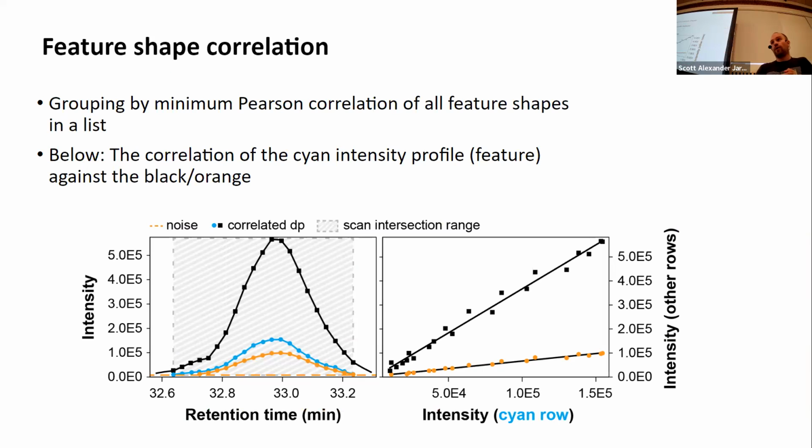Then we did not only use this MS1 data to get quant information, but also to look at different adducts. This is in one of the modules in MZmine, ion identity networking, where we look at co-eluting features that have given mass differences.